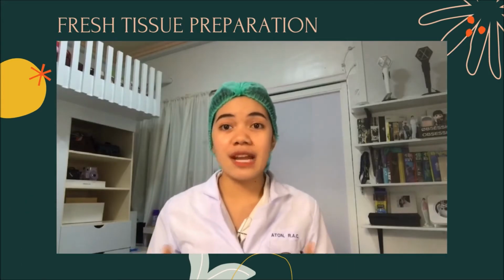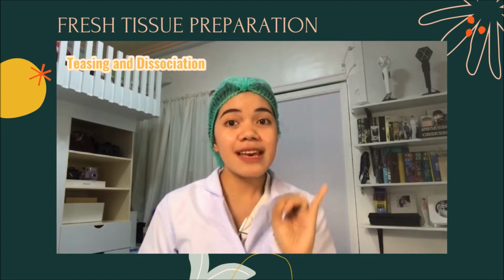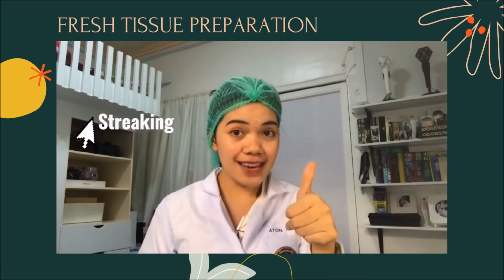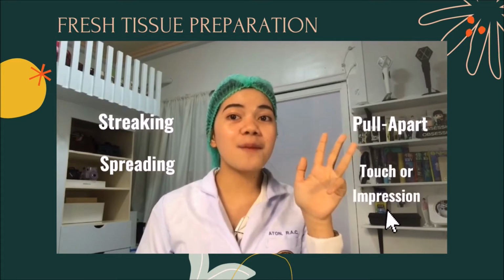We have various ways on how to perform the processing. First is the teasing and dissociation, the squash preparation, and the smearing, which has 4 different ways: streaking, spreading, the pull-apart method, and the touch or impression smear.